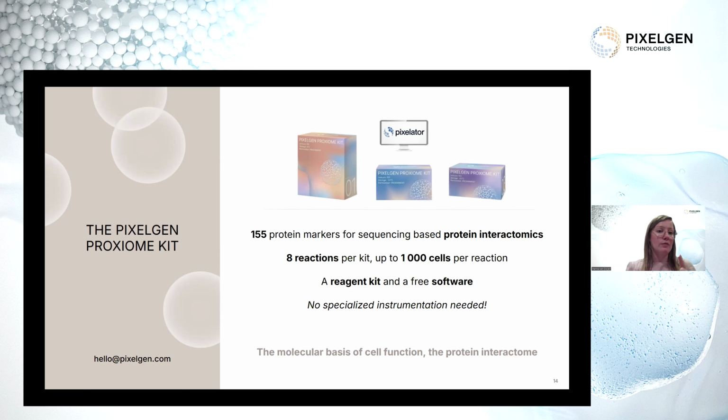Then informatically, you can of course detect which are your tumor cells and which are your CAR or non-transduced T cells. If you're doing experiments where you have, for example, tumor infiltrating cells, or very low amounts of CAR T cells as compared to tumor cells, you can do a pre-enrichment. You can select your T cells using flow cytometry, FACS sorting or bead sorting to enrich that population, and then run the assay itself. This depends a little bit on your experimental design, I would say.